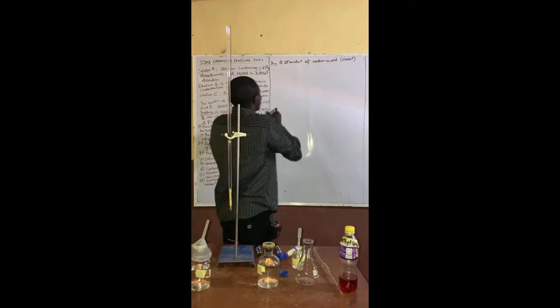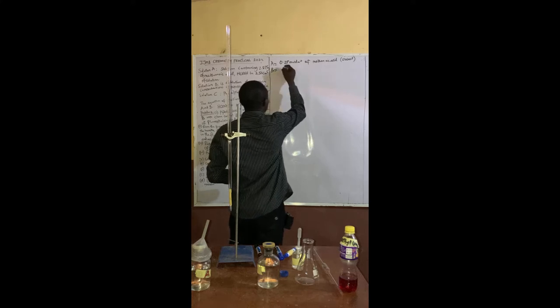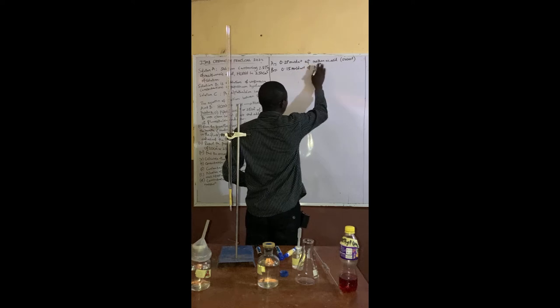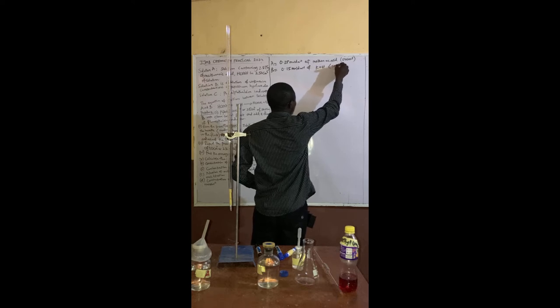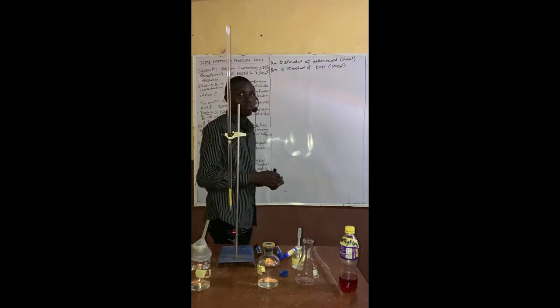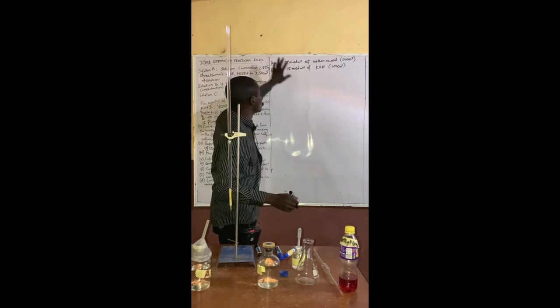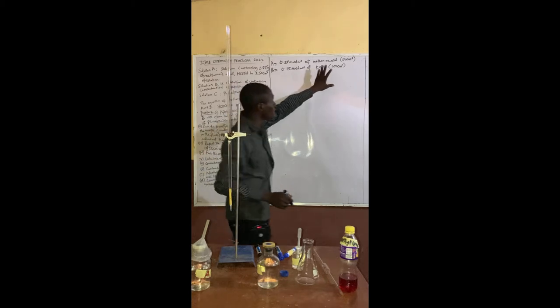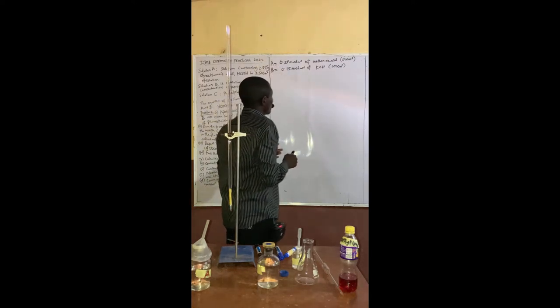We are given B as well, which is our base, a strong base, 0.15 mole per dm cube of potassium hydroxide, about 100 centimeter cube. You can pipette this, even using 25 centimeter cube, pipette 4 times. So this is going into our conical flask. From the reagents and conditions for preparation, we can guess that A will be inside the burette and B inside the conical flask.